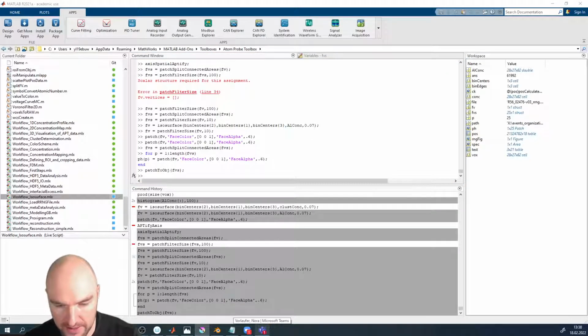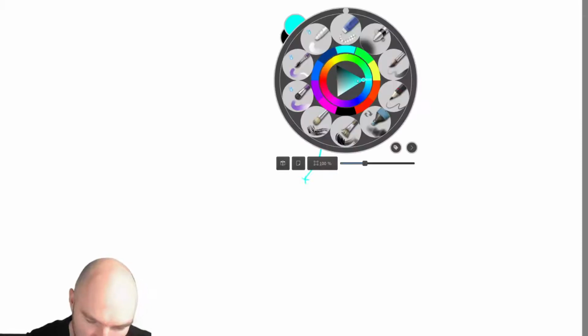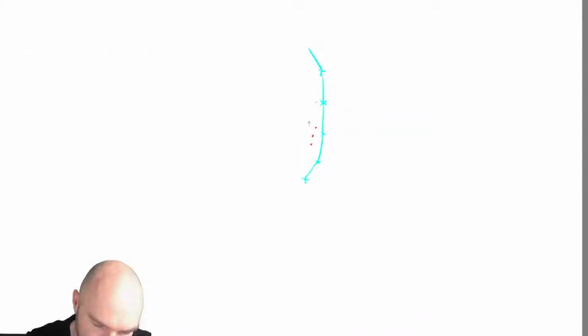I'll just make a little sketch about that. It's actually pretty intimately connected mathematically to what we've been doing so far. Just imagine again that we have some kind of interface that consists, in 2D, of edges and vertices, and it looks at least somewhat nice. And now maybe a lot of atoms here, and we don't have as many atoms here. This is something that can definitely happen.